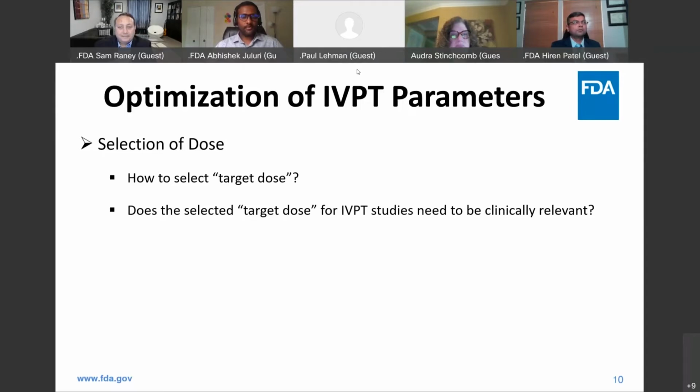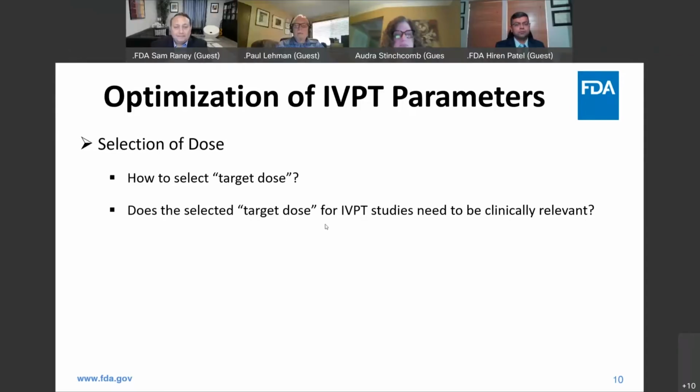One could start with the bounds. Your lower applied dose has to be sufficient to match your ability to quantify the drug that penetrates. So it may be a function of your LOD or LOQ. The high end is when it's no longer a finite dose and you're saturating the skin or ending up with steady state kinetics. The question really is, where's the sweet spot in between? Is that 5, 10, 15, 20? That's part of the methods development step to find out where in that range you are within those boundaries.